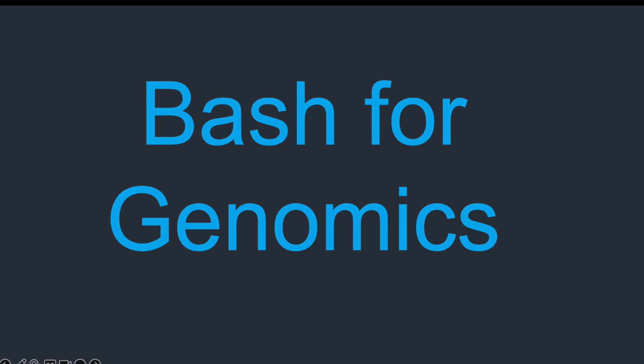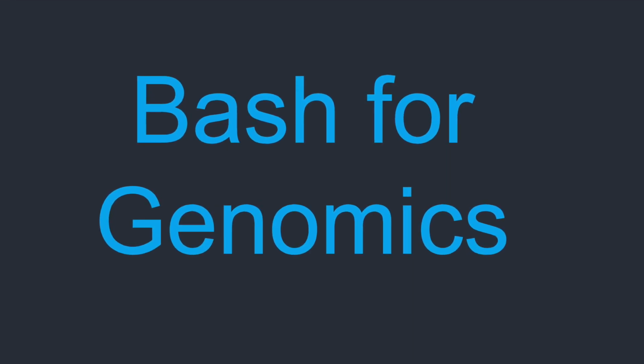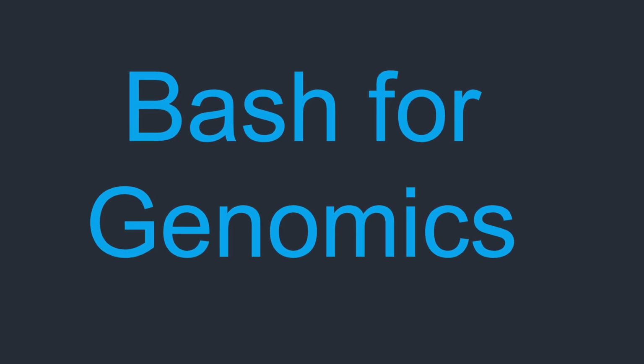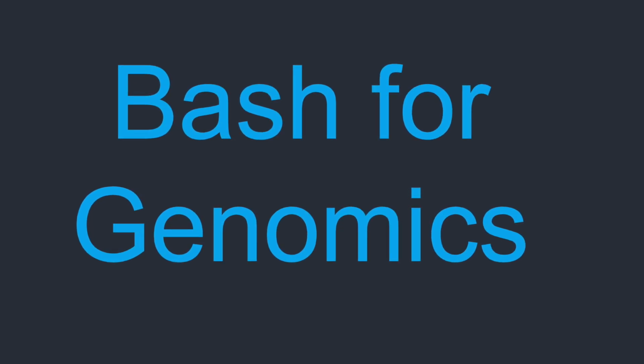To work with command line interface or CLI, we need to learn more about basic bash commands. For that, I have started a separate course, which is Bash for Genomics, where we will learn about bash scripting to automate and streamline the tasks in genomic data analysis.